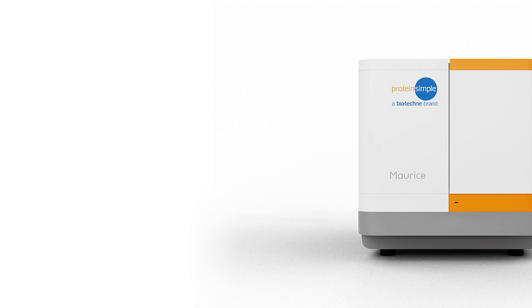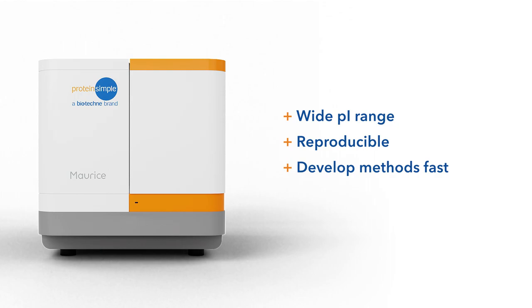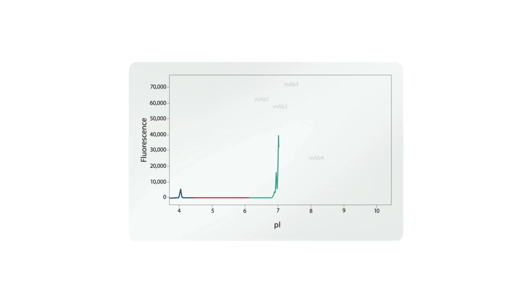The whole column imaging with detection allows you to monitor the separation in real time. Maurice collects data in both absorbance and fluorescence modes for each injection, then automatically analyzes the data for you. With a simple streamlined workflow and wide pI range, get results in just six to ten minutes.